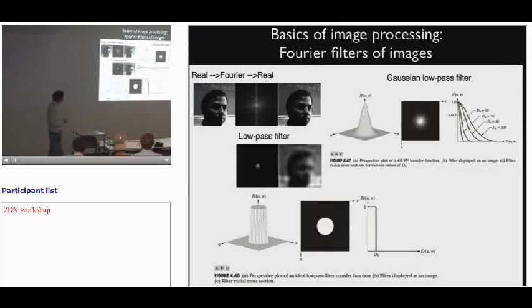However, you can of course also make up other cases where you now have a continuous filter function as, for example, Gaussian, and this way you can avoid a lot of the artifacts that you would introduce in these top hat kind of filters. And then of course you can also design your own type of filter with certain maxima at certain frequencies and so forth. Now, these are all filters that are basically symmetric, if you will, over Fourier space.